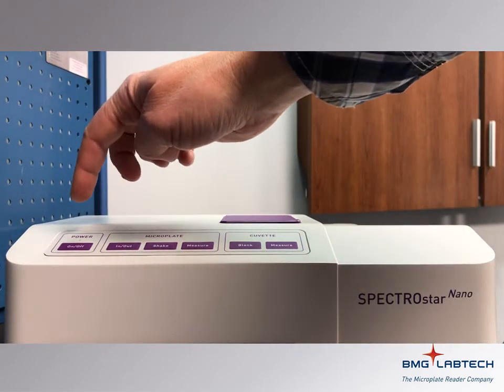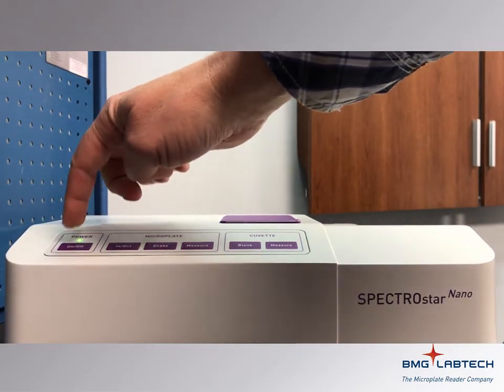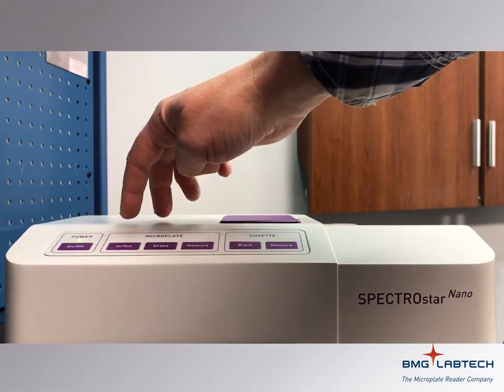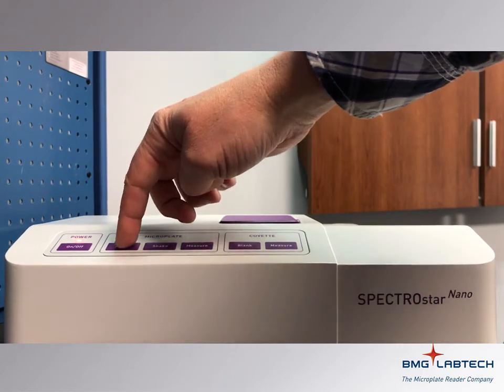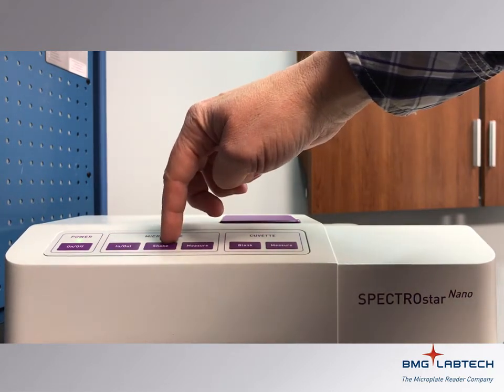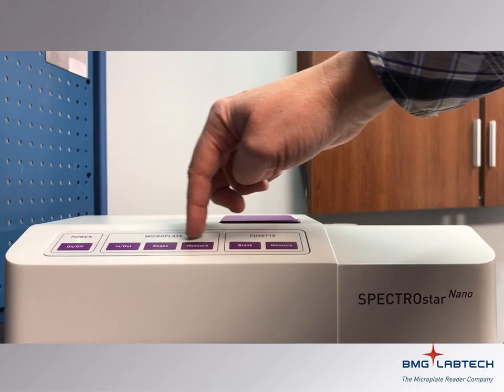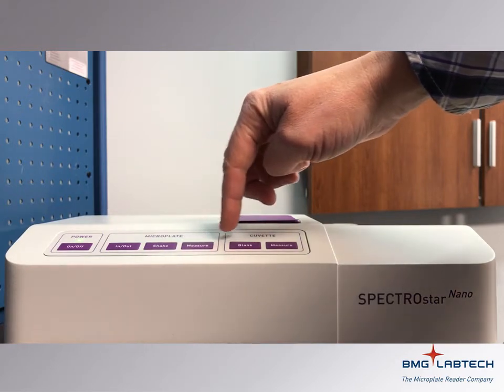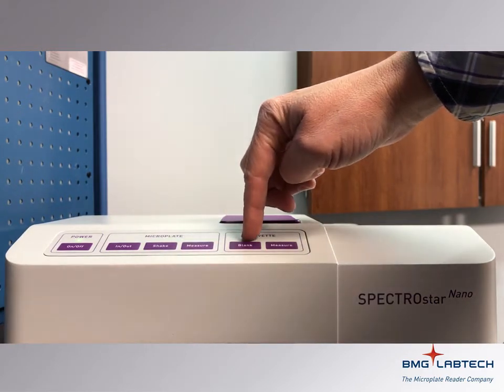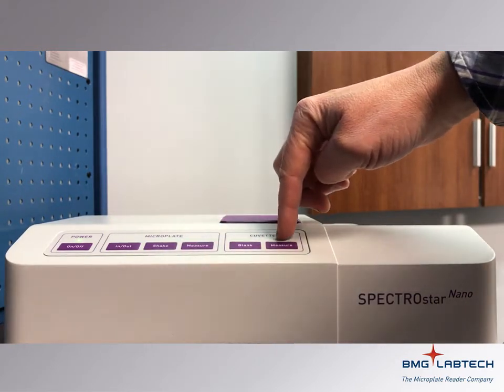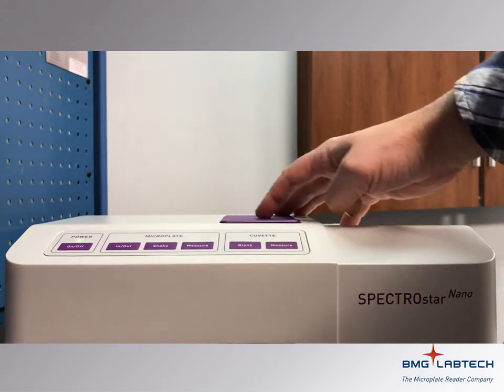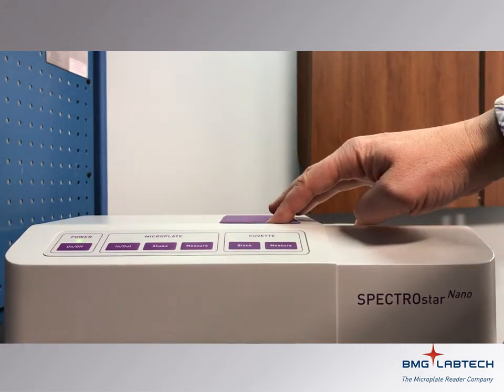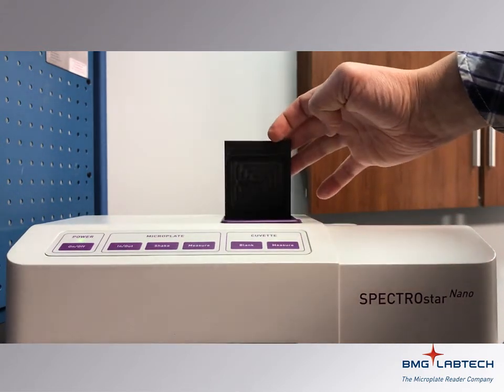On the front of the reader you will find the power button, buttons that move the plate in and out, shake the plate, measure the plate, also controls to blank and measure a cuvette. The cuvette port is accessible on the top of the reader.